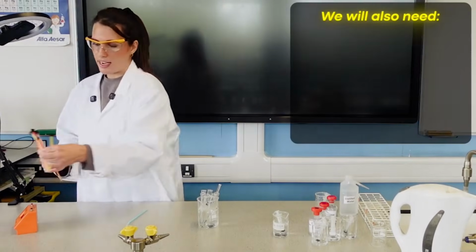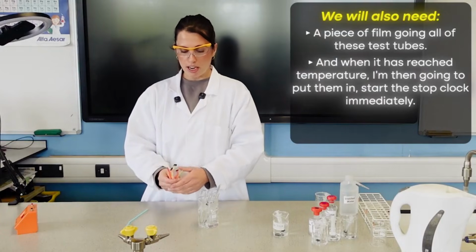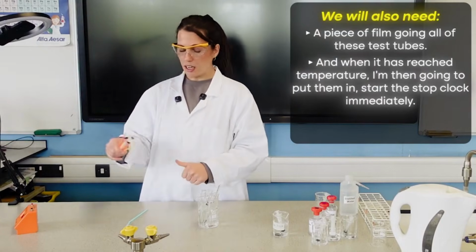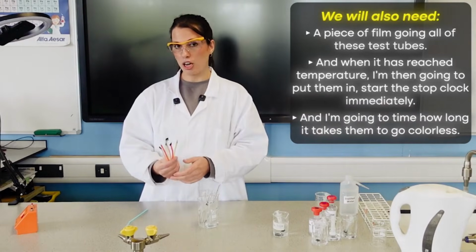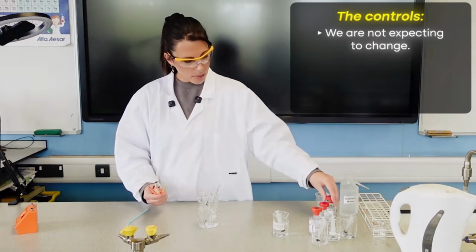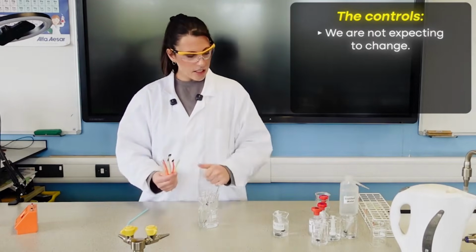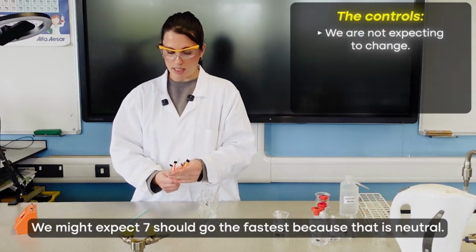We will also need a piece of film to go in all of these test tubes. And when it has reached temperature, I'm then going to put them in, start the stop clock immediately, and I'm going to time how long it takes them to go colorless. The controls we are not expecting to change. And we've got pH 4, 7, and 9.2. So we might expect 7 should go the fastest because that is neutral.